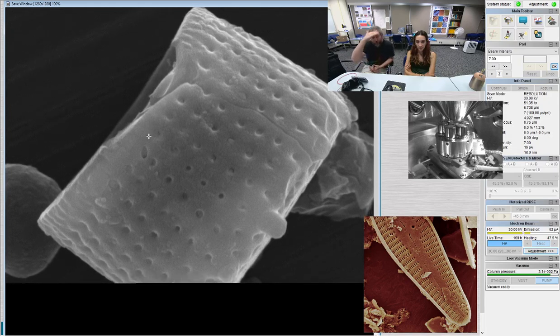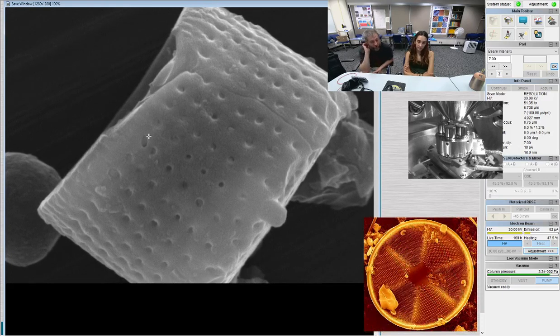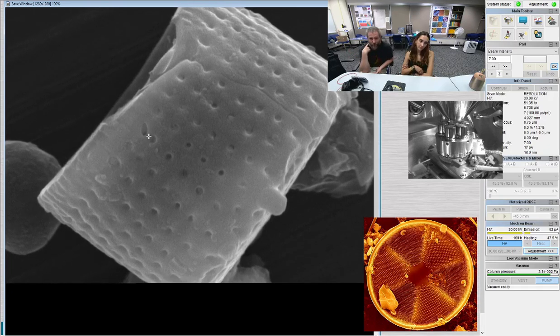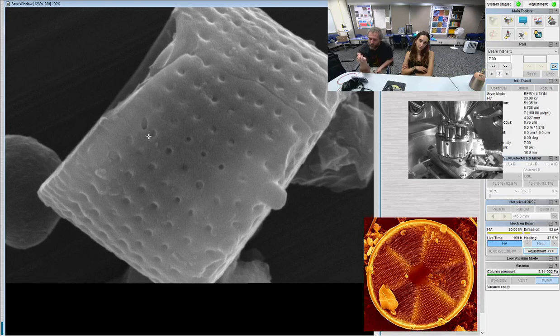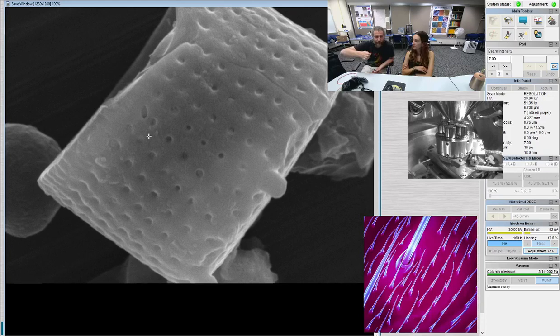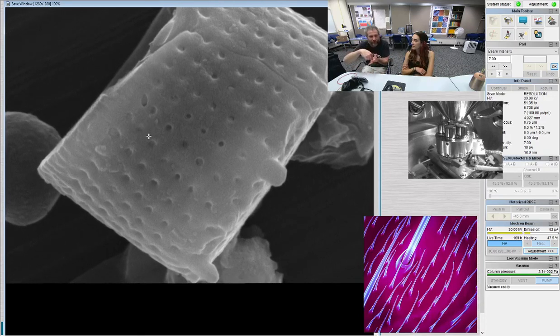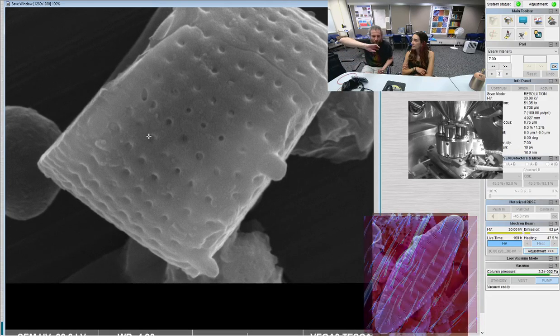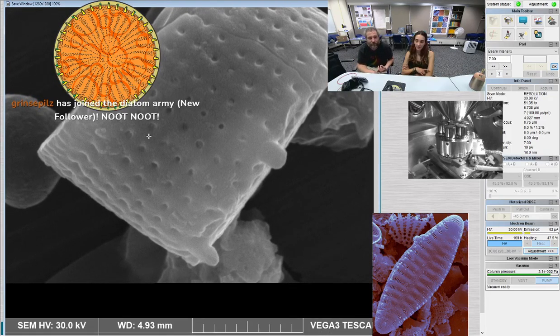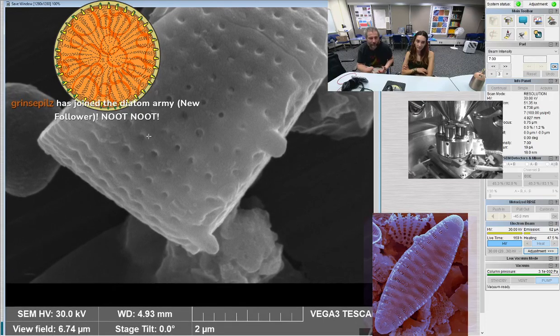Yeah, they're on stubs, but the same idea is the case. In a light microscope, if we're looking at something on a glass slide, usually what you use is something called a diamond scribe. It's a little piece of a diamond like you'd find in a record needle, attached where an objective would go on the microscope. Then you raise the slide up until the glass is touching the diamond, and there's a little knob you can use to turn it, and it will create a circle. We'll actually cut a little divot in the glass, and that will leave a mark that people can find again.